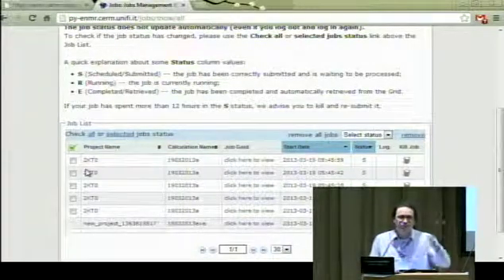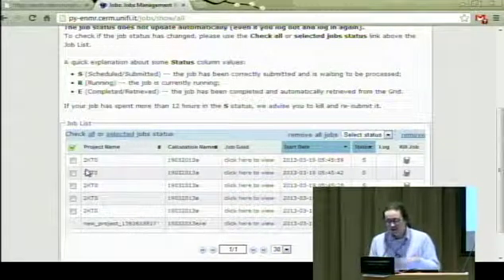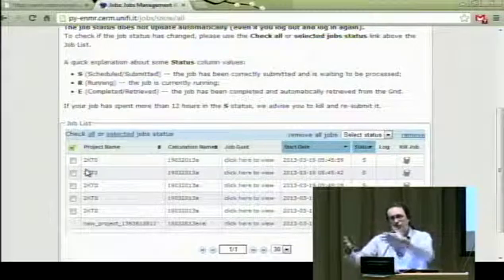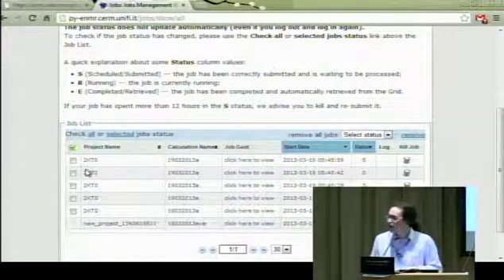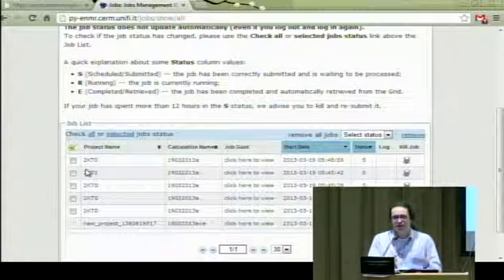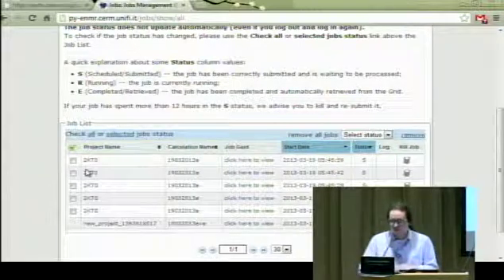We cut time because the number of CPUs in the grid is large enough. You cannot split them too fine because otherwise, as I was mentioning, you end up spending more time waiting for the grid than actually doing the calculation. So you have, in a way, to balance between how finely you divide the calculation and how convenient it is with respect to the time you are waiting.